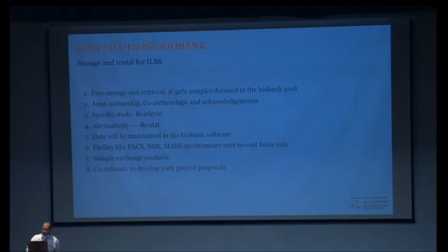Alternatively, you can avail the rental facility where you can pay the Biobank beforehand, and you can store your samples for a year or whatever time you want. And then data will be maintained in the Biobank software along with the samples. You will get the data, whatever data you want and whatever we have. And then facilities like FACS, NGS, and MS are available to researchers on a cost-to-cost basis. There is no profit, no manpower charges, nothing is levied. And the sample exchange I have already explained. We also coordinate to develop joint proposals if somebody has samples and somebody has the idea.